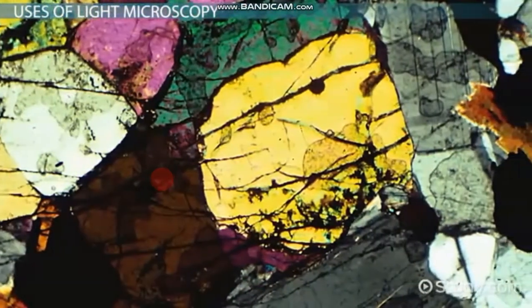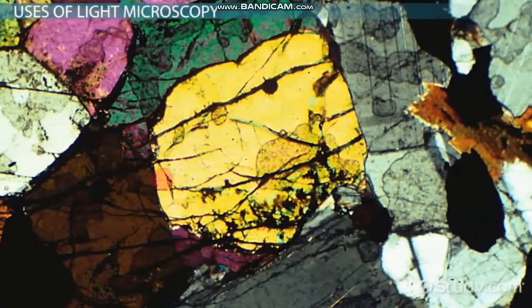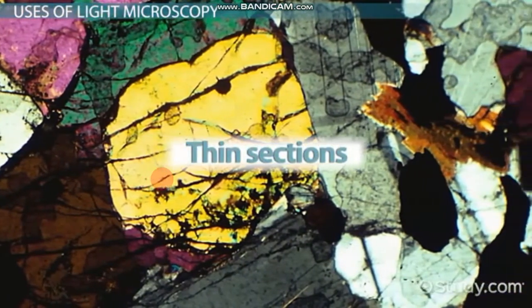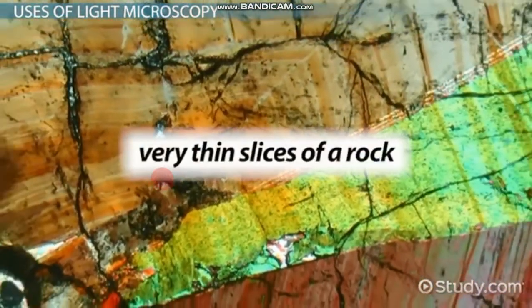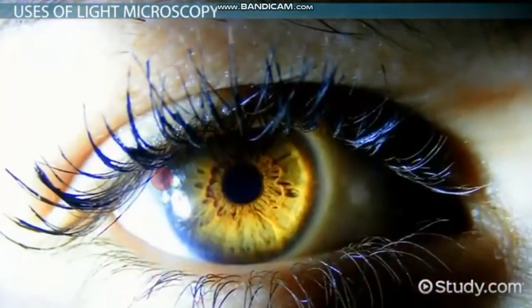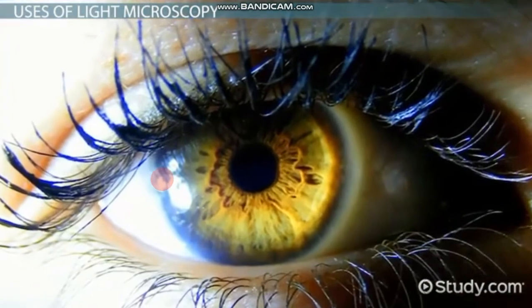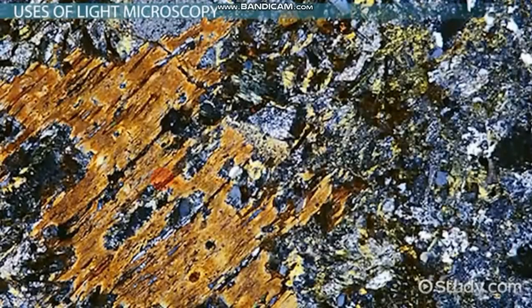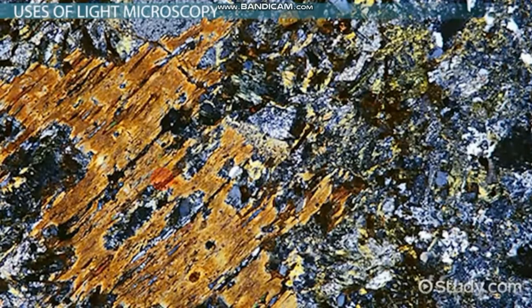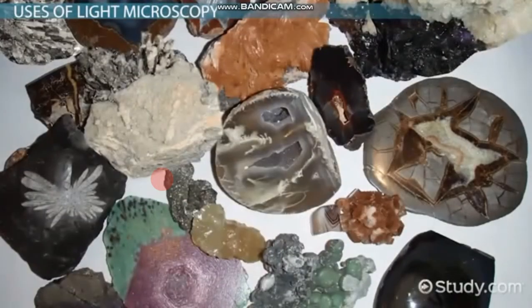Mineralogists also use light microscopy, typically with a special preparation of a sample called thin sections. As the name implies, thin sections are very thin slices of a rock. The sample needs to be thin enough for light to travel through from the light source to the user's eye. The thin section will allow the shape of different crystal grains to be seen. These shapes can tell the user what kinds of minerals are found in the sample.